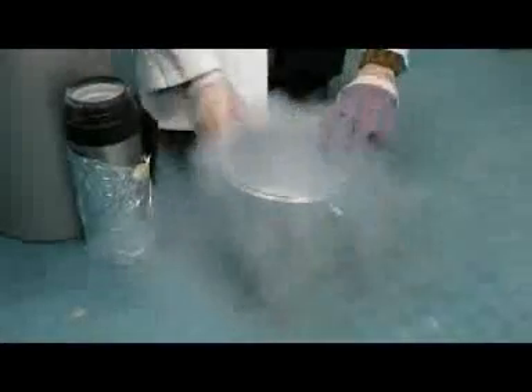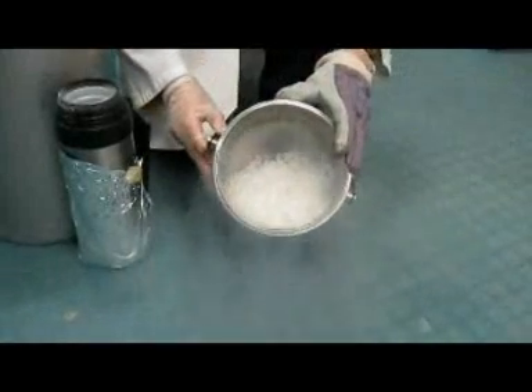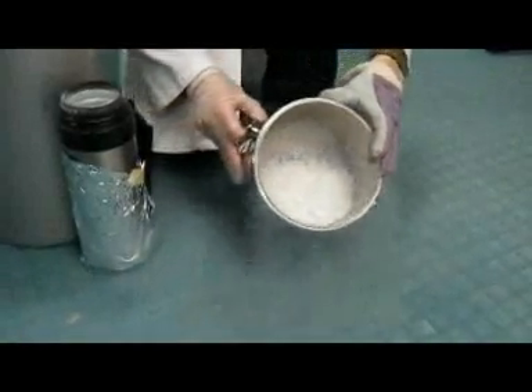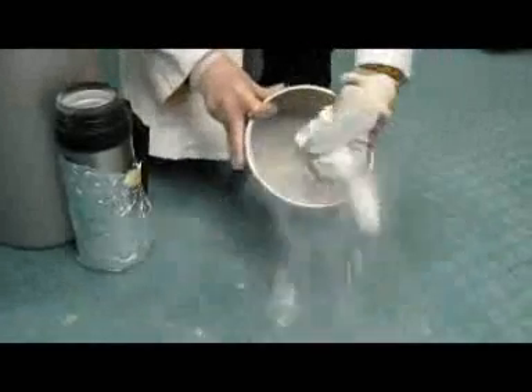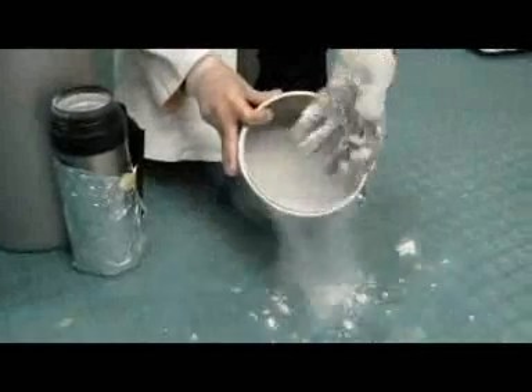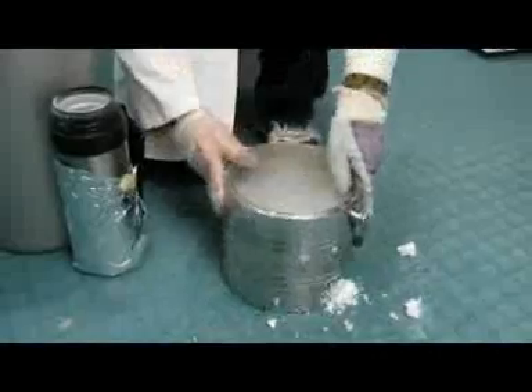There you go. Let me show you what the acetone snow looks like — that's frozen acetone. It feels just like regular snow, but if you look at the floor here, it's actually melting really fast, because the floor is pretty hot compared to the acetone.